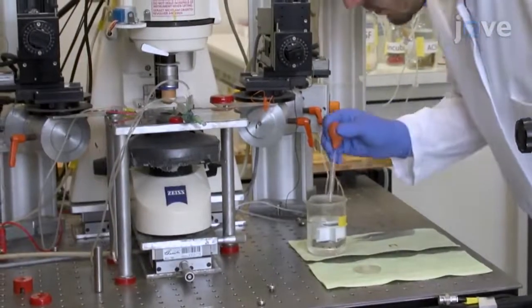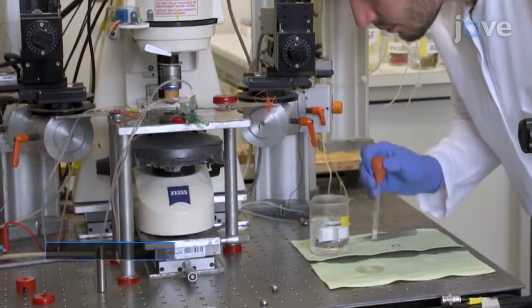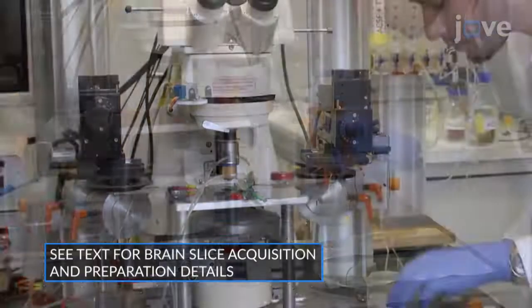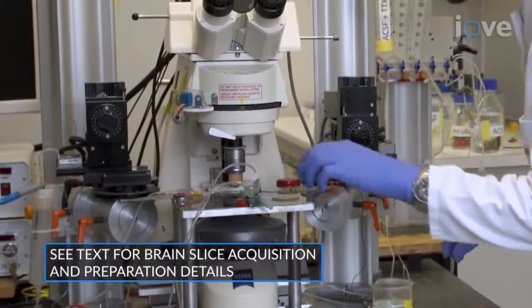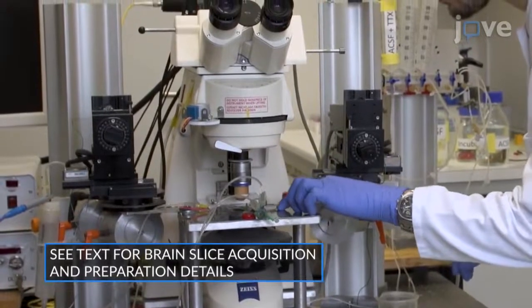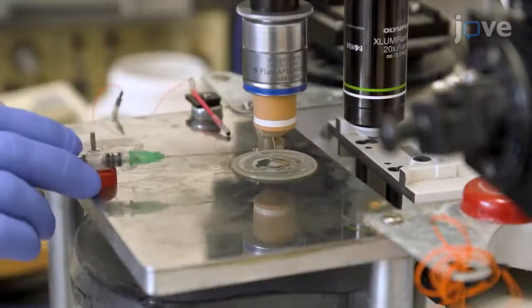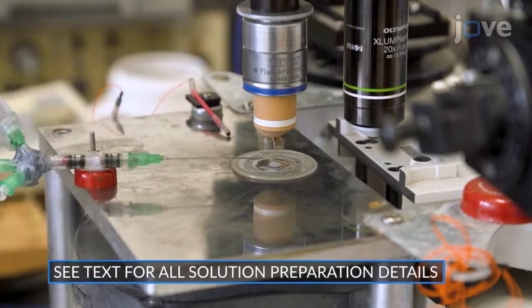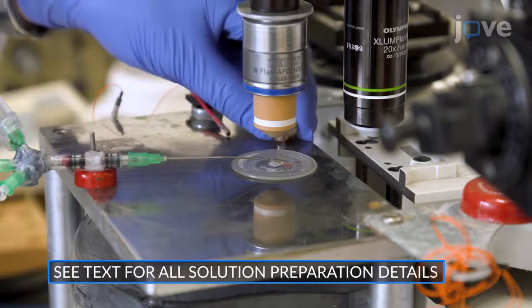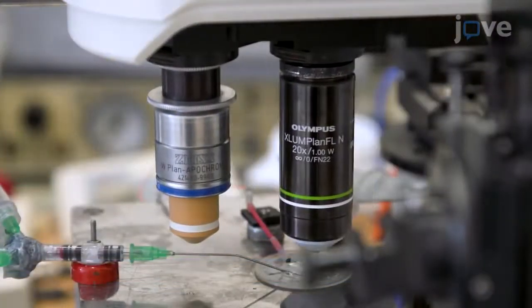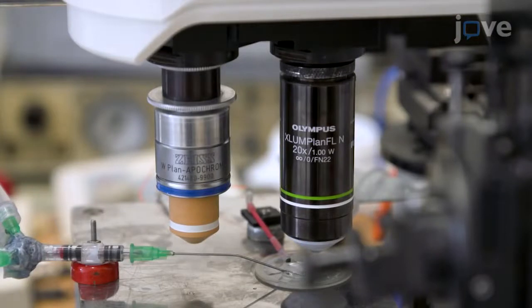For autofluorescence correction, first place a brain slice from the mouse of interest into the recording chamber of a one-photon microscope. Submerge the slice in oxygenized artificial cerebrospinal fluid and use the 20x water immersion objective to locate the dorsal striatum.